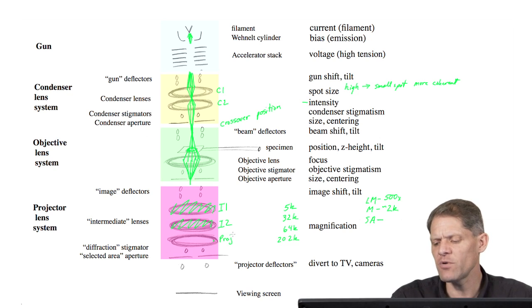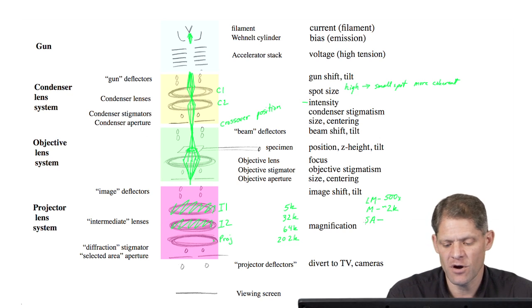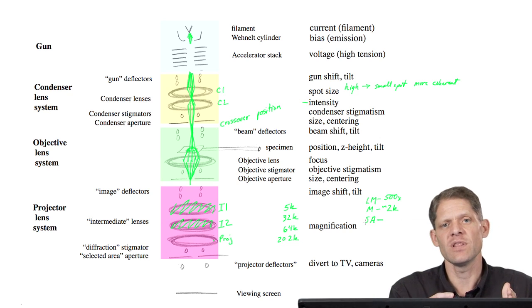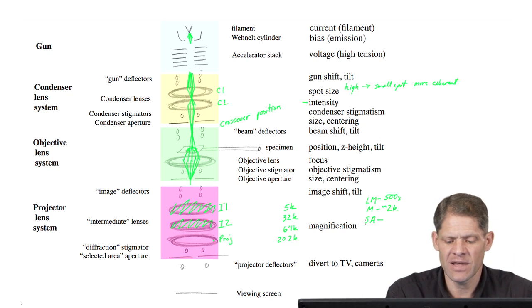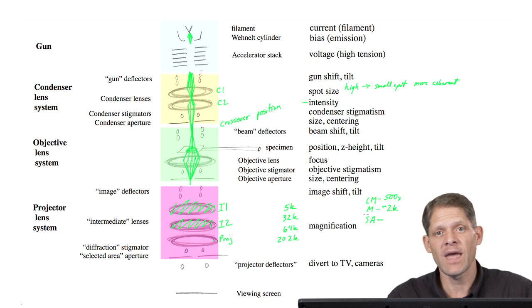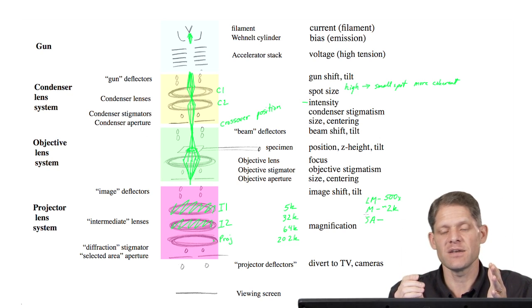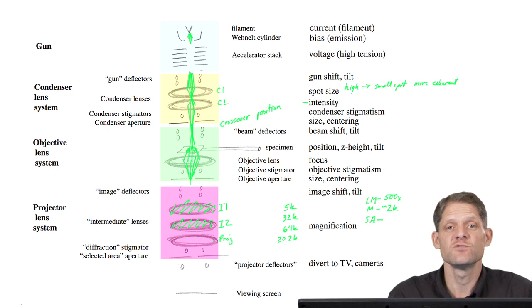Now when you go through these ranges, you need to be aware that switching ranges can dramatically affect the microscope, because turning on or off a lens can change significantly how much heat is being produced by that lens. So for instance, if you're working in SA mode and your microscope is well aligned, and then you drop to LM, two of the lenses will turn off.